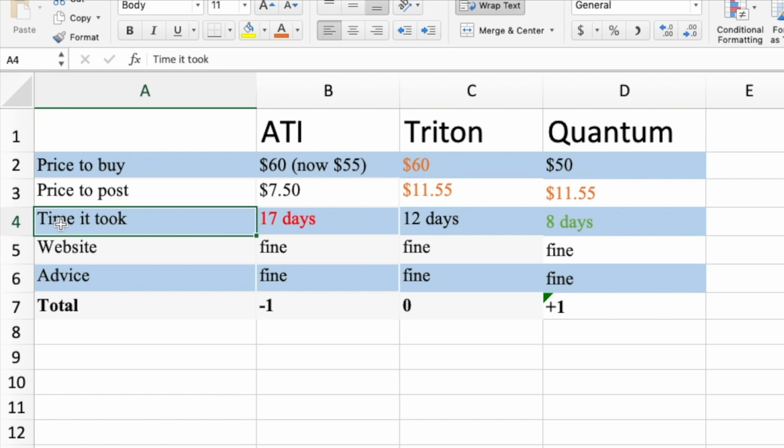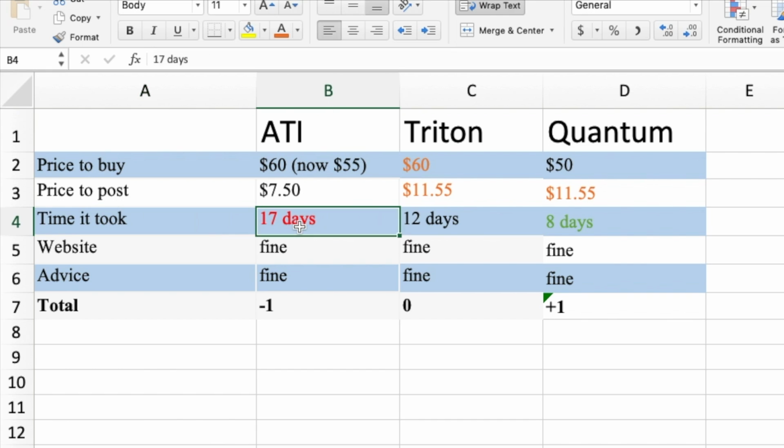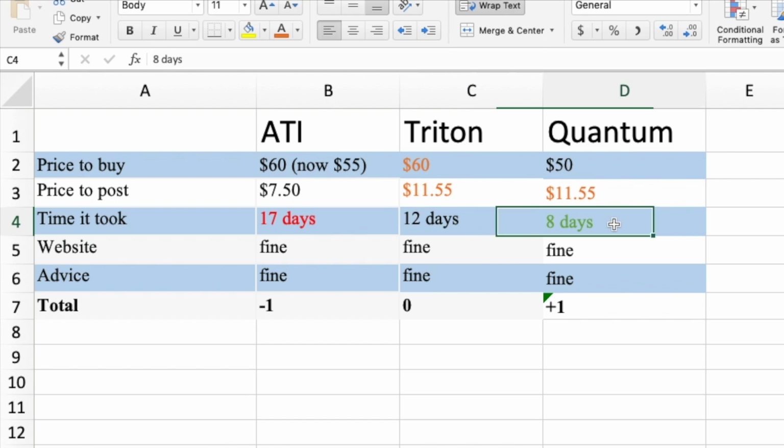So the time it took for the results to come back, ATI were the slowest. I still think that's pretty quick at just over 2 weeks, but I'm going to take a point off because they're a fair bit slower than the others. It's 17 days. It took a little while, but like I said, personally, I think that's fine, but they lose a point for that. Triton, and in full disclosure, this was the quickest Triton test I've ever had. I'm not sure if they got wind of the video or not, but 12 days was exceptional. Normally I would give a point for that, but the Australian guys, Quantum, outdid them, taking just over a week to get the results back, which is an incredible service. So I couldn't help but give them a point for that.